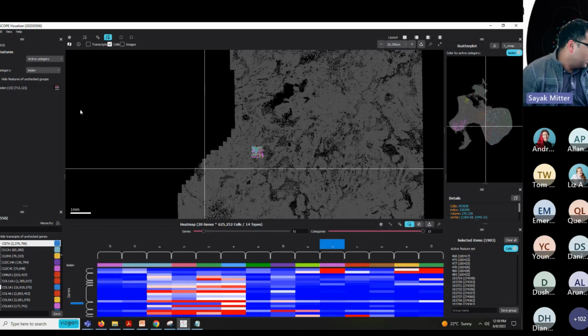For Hangyu Liu, the fluorescence of the slide itself, GFP or tdTomato, if you have that on the sample, it's a great question, by the way. As part of our sample preparation, we have a method called sample clearing, which is a part of the procedure. What it really does is remove the fluorescence from your fluorescent tagged protein, so downstream that fluorescence should not be seen.